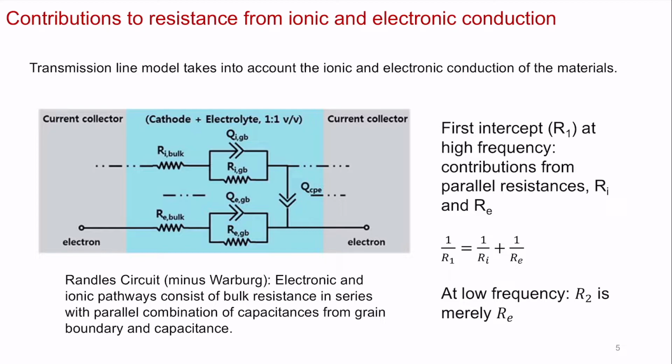And so in terms of how to actually break down the individual components, what you see here is you can make a transmission line type of equivalent circuit that we talked about when we talked about EIS fitting with elementary circuit components. So you have what you typically expect, right? The ionic conductivity through the bulk, as well as in series through the grain boundary, but the grain boundary has a resistive component as well as a capacitive component, right? Because it can store charge right there.